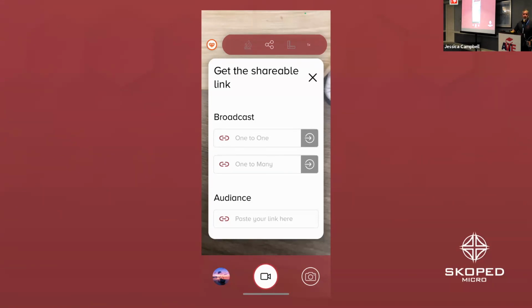Do you have another question? Yeah, someone was wondering, can you broadcast to a PC? Right now, it's just the mobiles. But we're looking at some other avenues. Not yet. We've talked about that. Yes.